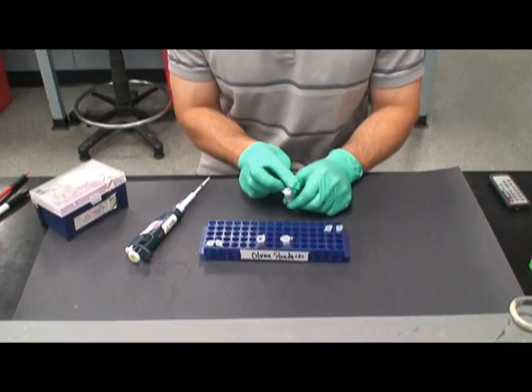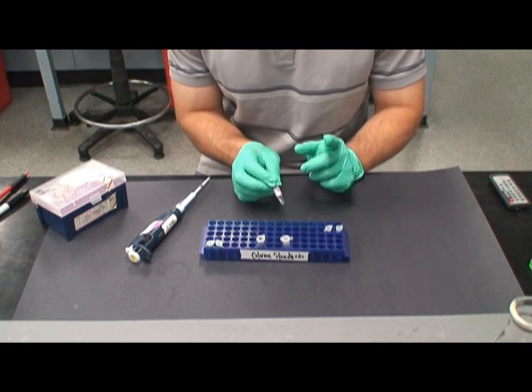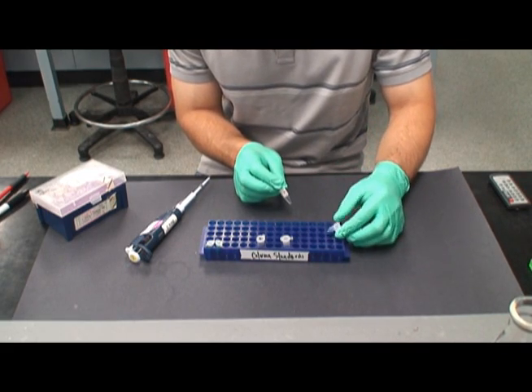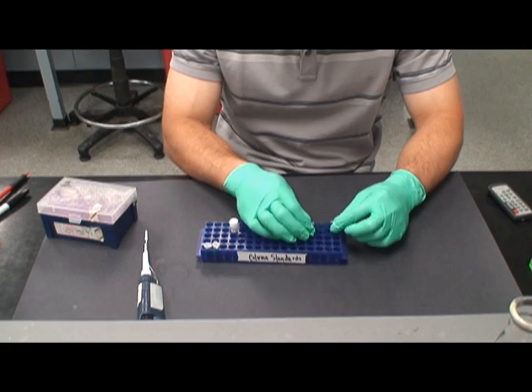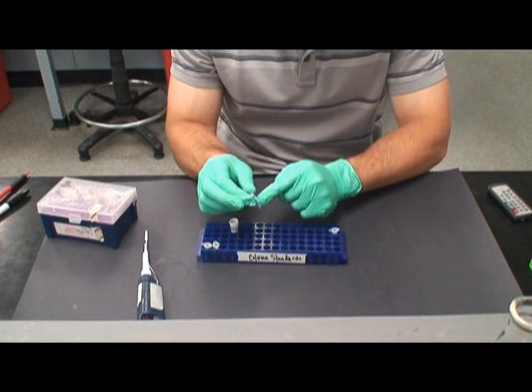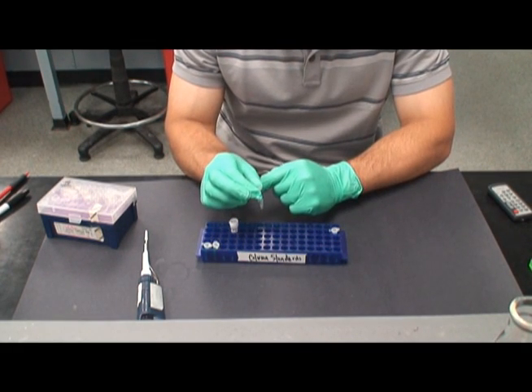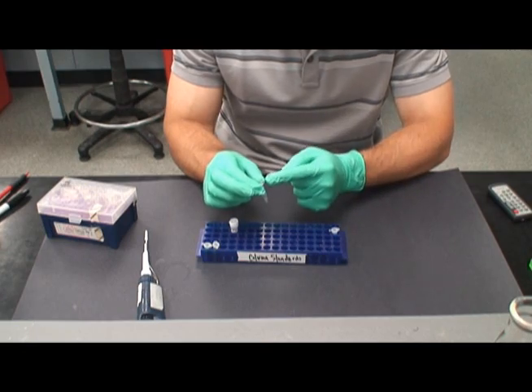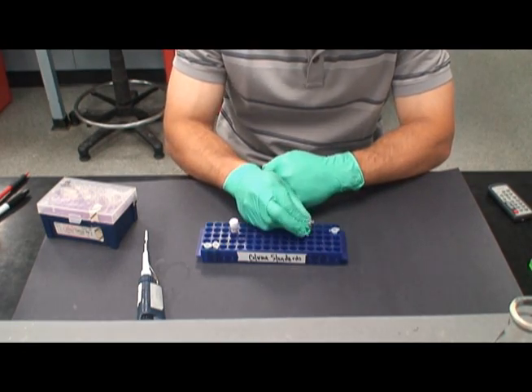2 microliters of Hindi 3 enzyme are added only to the PUC19 Hindi 3 tube. Water is added to the other tube. A brief centrifuge will ensure that all the liquid is at the bottom of the tubes. The tubes are then incubated for 10 minutes at 37 degrees Celsius.